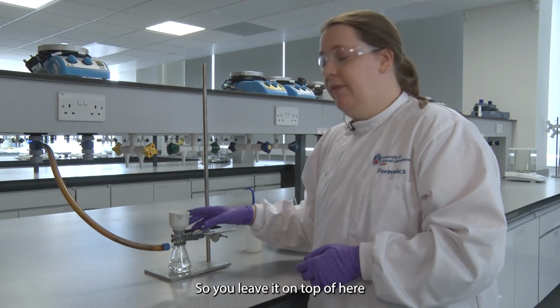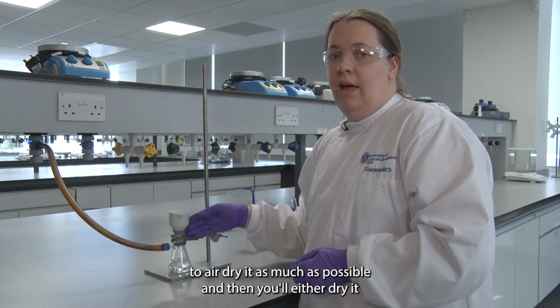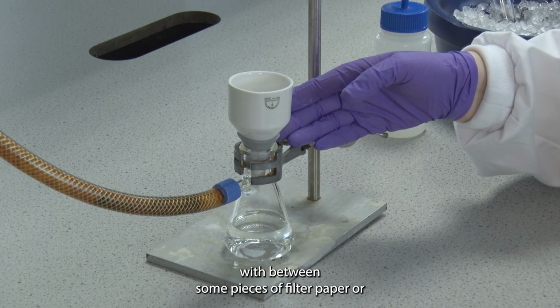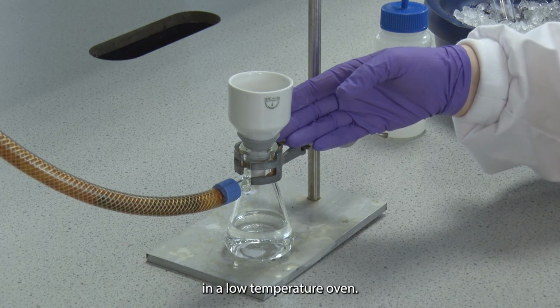So you'll leave it on top of here to air dry it as much as possible, and then you'll either dry it between some pieces of filter paper or in a low temperature oven.